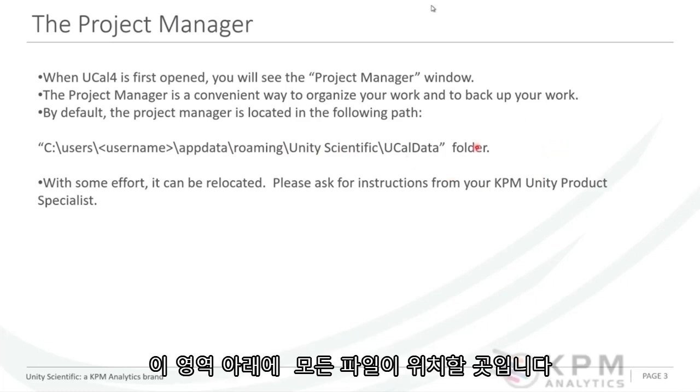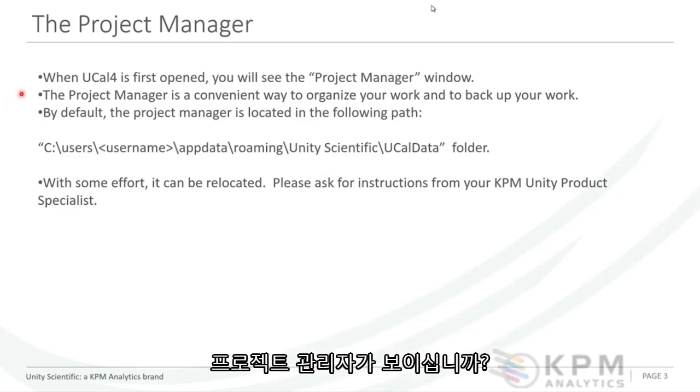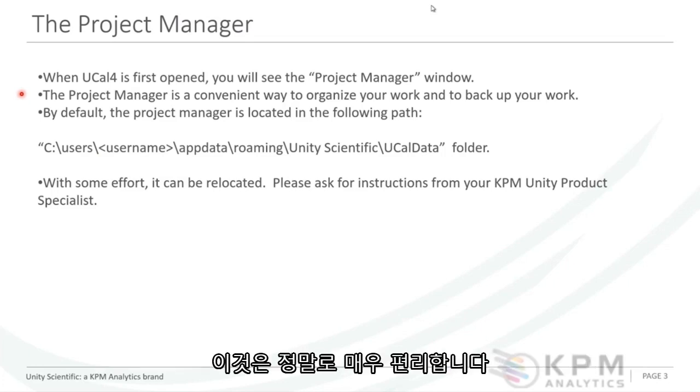So underneath this area is where all of your files will be located according to your project and your group and your subgroups. Okay, and those are all individual folders. You see the project manager when you first open up UCal. A lot of our customers, a lot of users work directly from the project manager, and that's it.